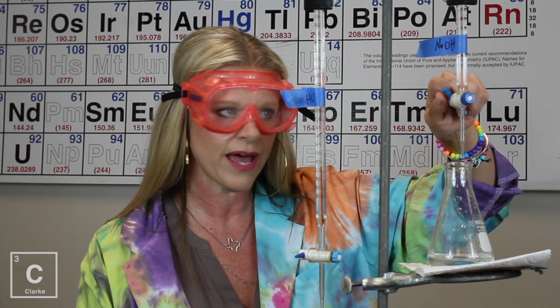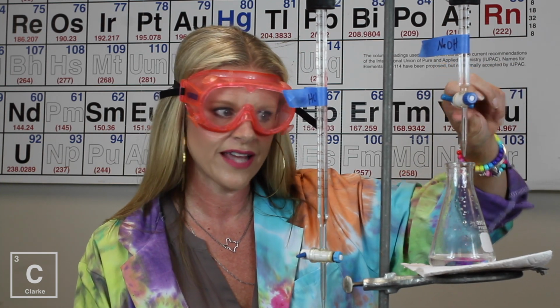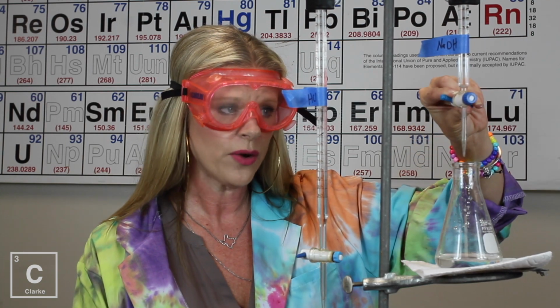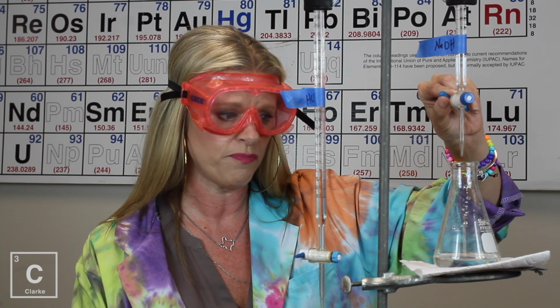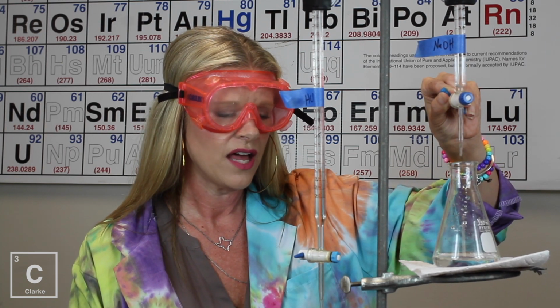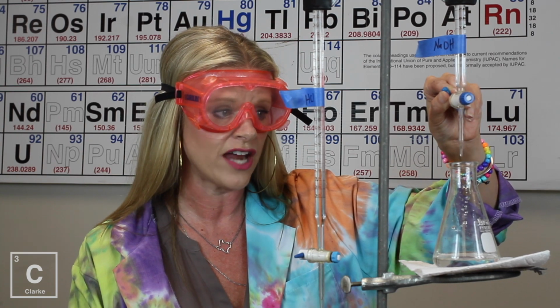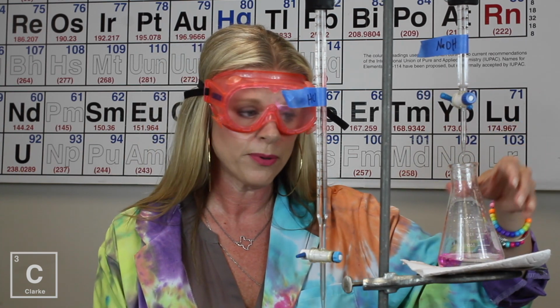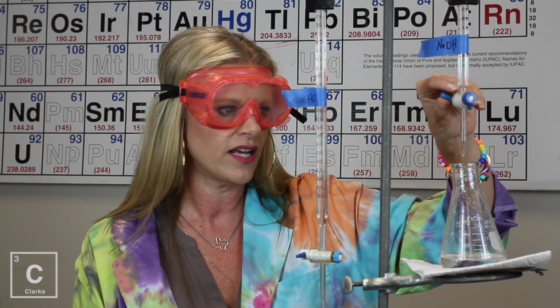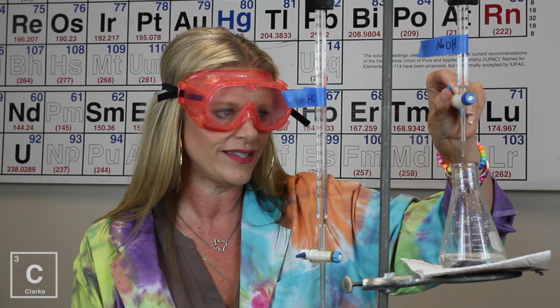Okay, so we went back to clear. This is still more acid than base. Let's continue adding a little bit of base. That was more than I meant to add. Oh, but that's okay. Look, it went to clear. Now I want to go until it is just the faintest color of pink. Faintest. Because remember, if it's got a solid pink, that means we're more basic, and I'm trying to find neutral. Now I've got this white paper towel under my flask because I am wanting this pink to be so faint, the white is going to help me see it better.